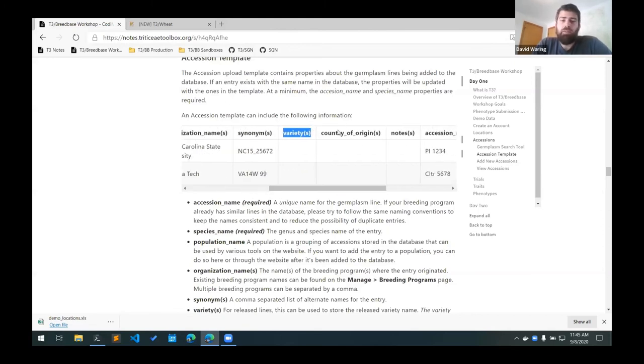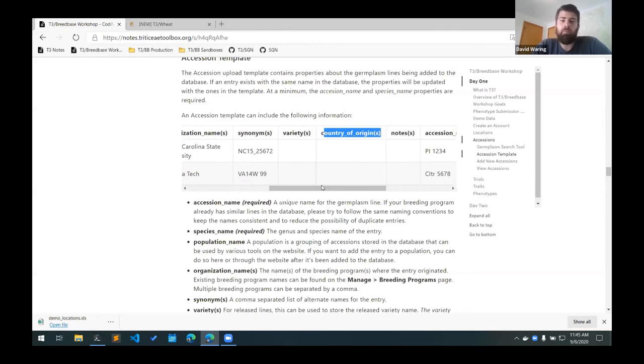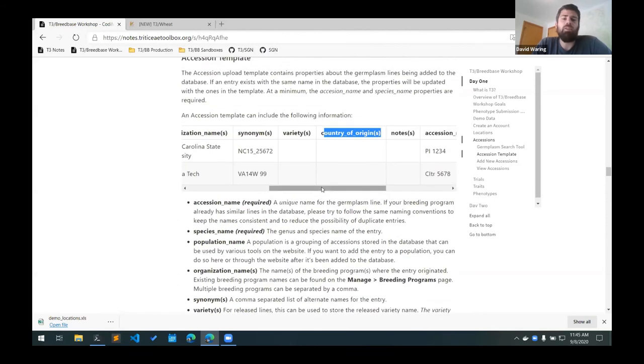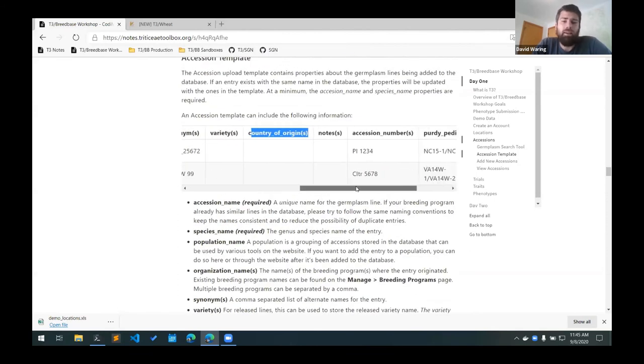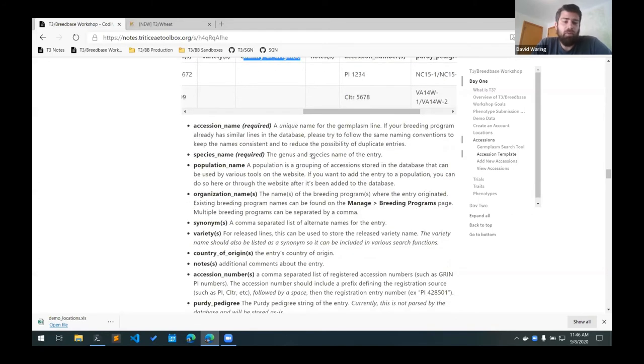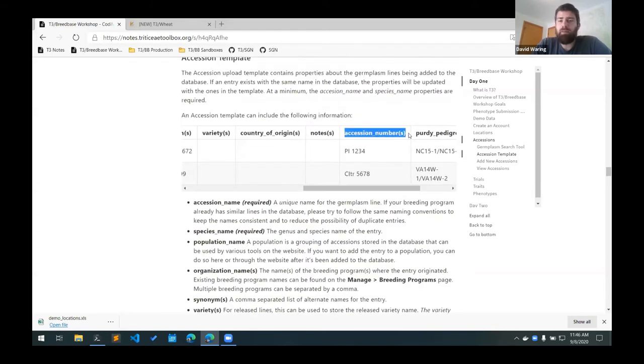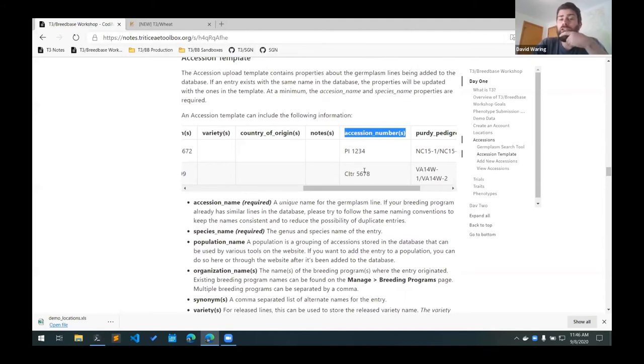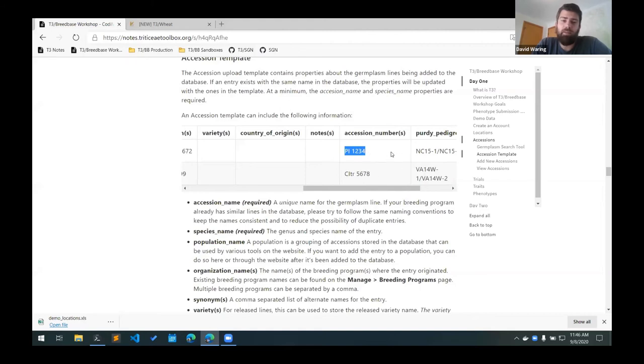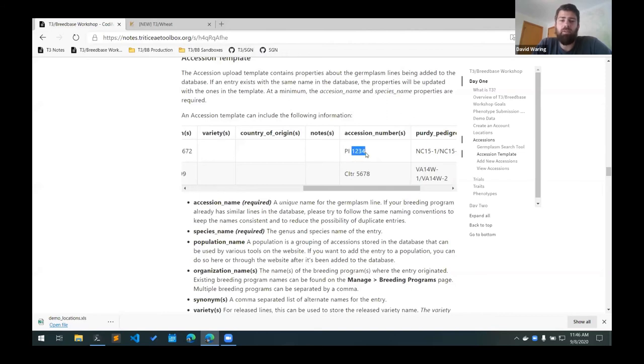The country of origin can be used to specify where the line originated from. We typically leave that blank unless it's not the United States. The notes column can be used to add any other details about the line. The accession numbers column can be used for registered accession numbers. So this is if there's a registered PI number for GRIN or CI number. And again, you can give multiple accession numbers by separating them with a comma. And then the format for the accession number is the prefix followed by a space followed by the registered number.